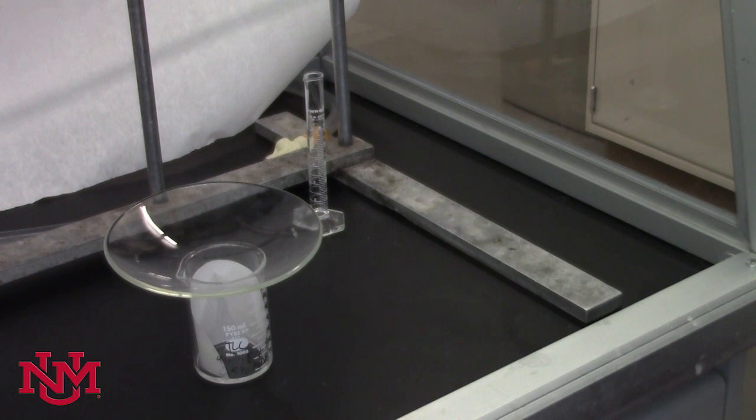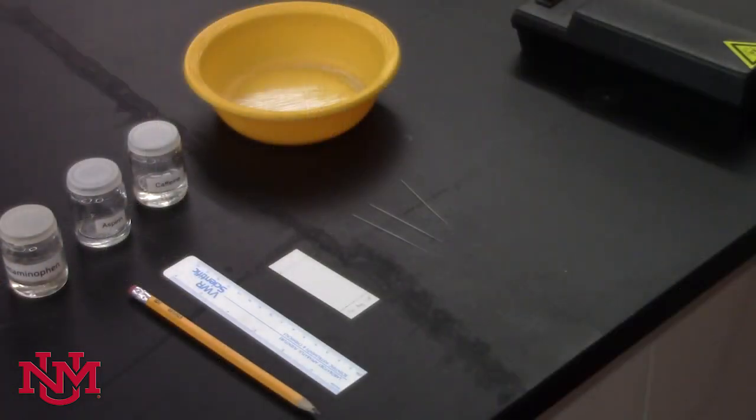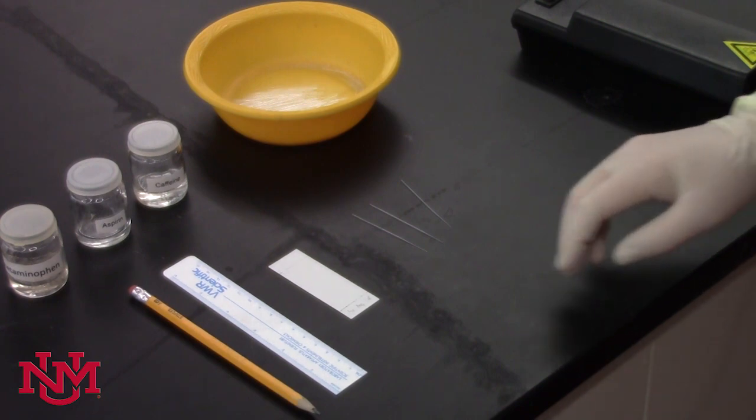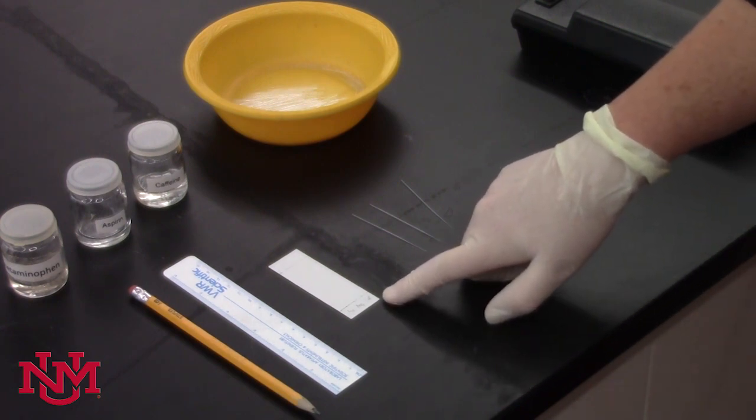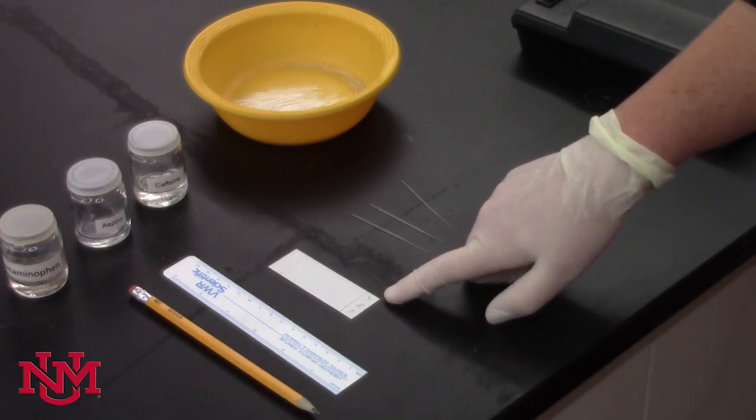The next step is to prepare your TLC plate for the developing chamber. To carry out a TLC analysis, you'll need a TLC plate which has a solid support coated onto plastic in this case, and it's made of alumina.